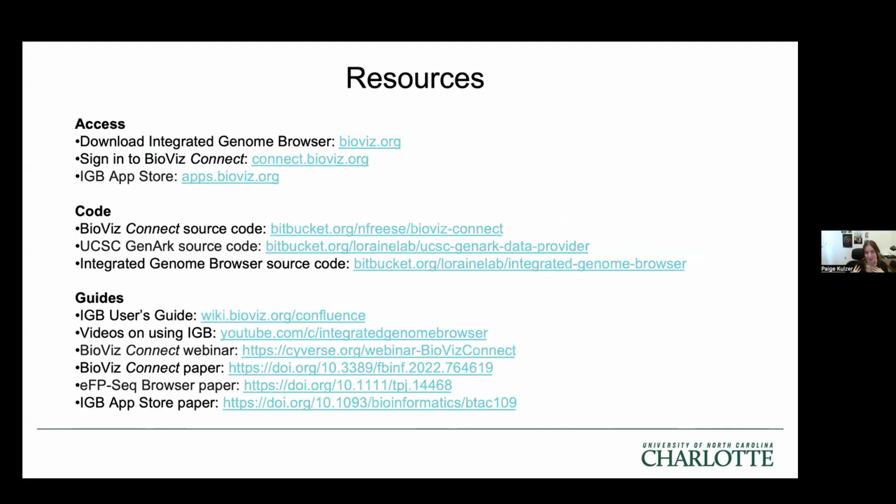And so we've got resources here. There's a lot of them. A lot of these are papers or previous webinars we've hosted where we demo some of these integrations. And we've also, again, got that source code available online. So if anyone wants to view how we've created some of these integrations, look at the actual code itself, you're more than welcome to. And I'd happily encourage it.